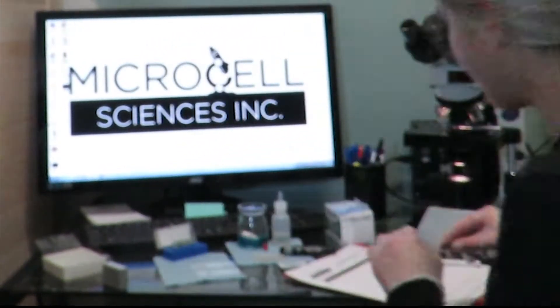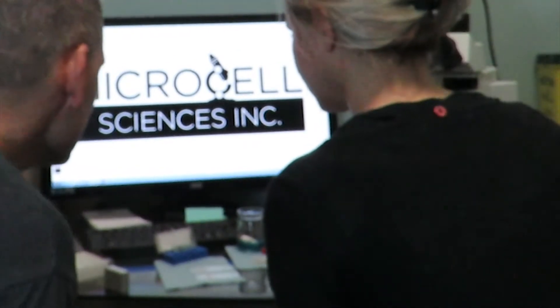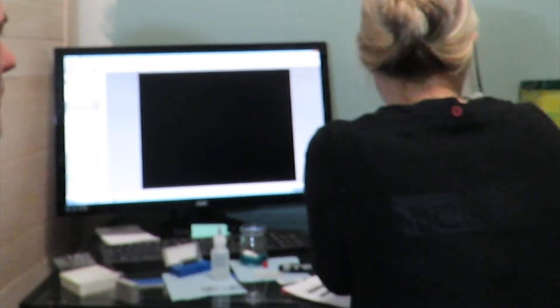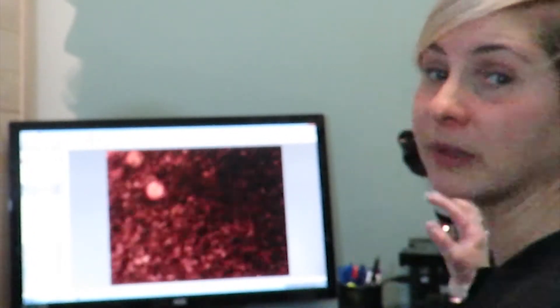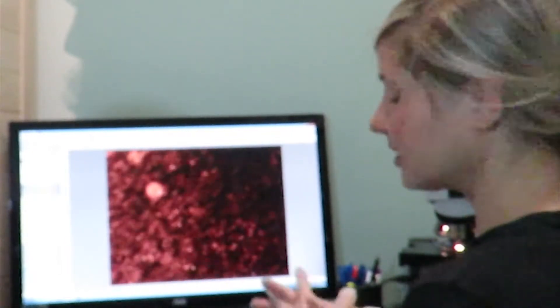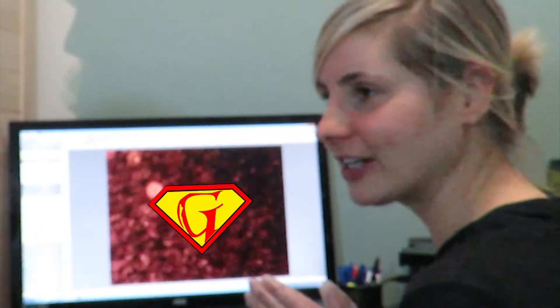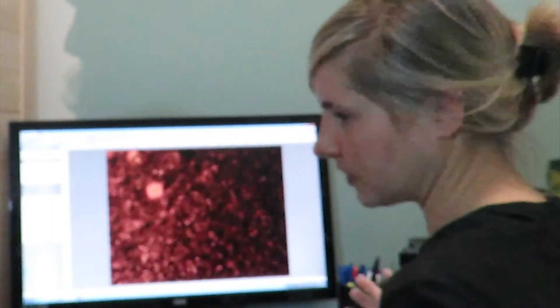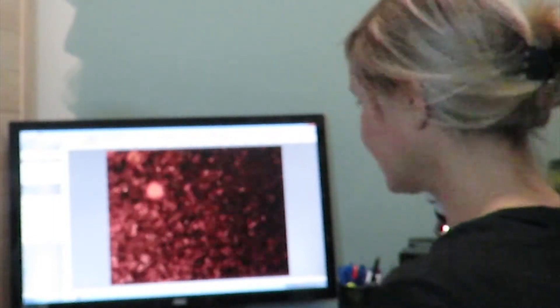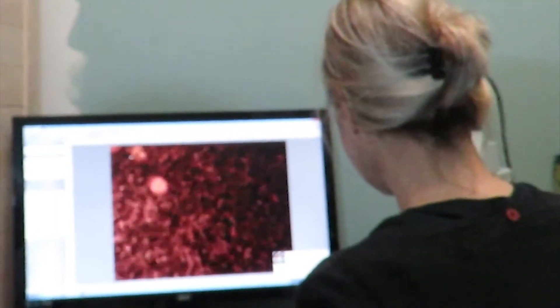We're going to cover these up with our little slip cover. Get some beautiful samples of Greg's blood. And what will they show us? Well, here we go. This is when the show begins. We're going to open up our program. We throw it on the microscope. So we'll see about five to seven million blood cells. This is fabulous, actually. This is superhero blood.